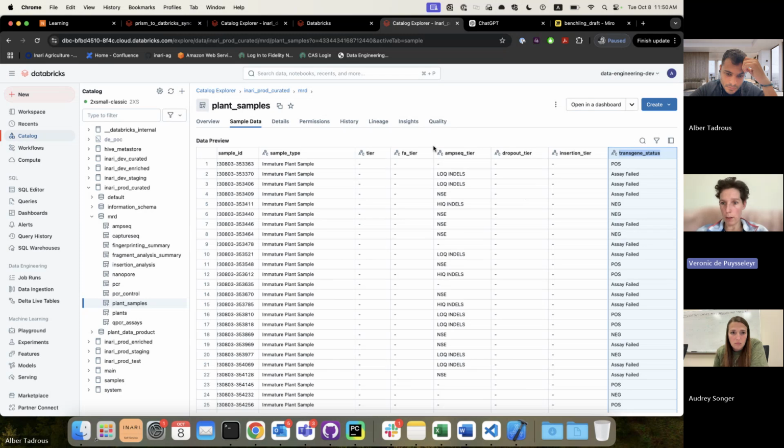And if it's another type, then you fill out the sample ID and any other column. Okay. Then you can keep your schema, and you just change it to biological samples.